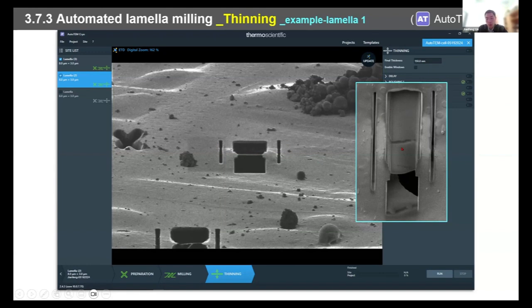During the process, you also can use the scanning EM to take one image. But in the end, if you don't be concerned about the damage, you also can increase the resolution or dwell time to improve the resolution. But if your sample will be used for high quality tomography imaging or single particle, I will suggest you try to minimize this kind of exposure, because every image will cause damage, especially since the voltage is low, so the radiation damage is relatively significant if that is a concern for your high resolution.